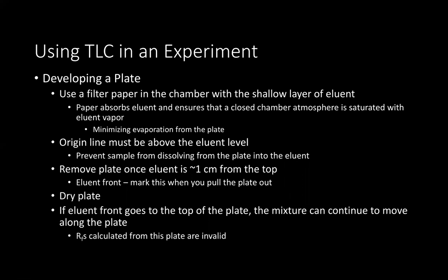The paper is going to help absorb the eluent and ensure that your closed chamber atmosphere is saturated with all of those eluent vapors. Basically, this ends up minimizing the time it takes to move that solvent up your TLC plate. It helps create that gas equilibrium much faster as your solvent moves up the plate.